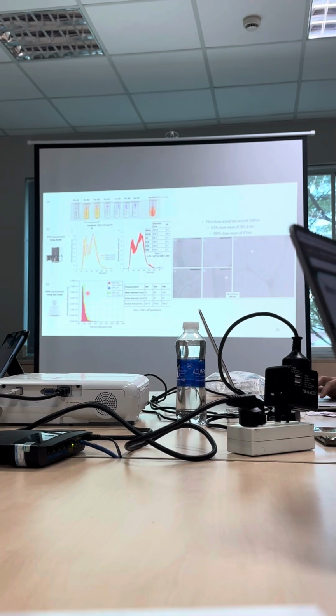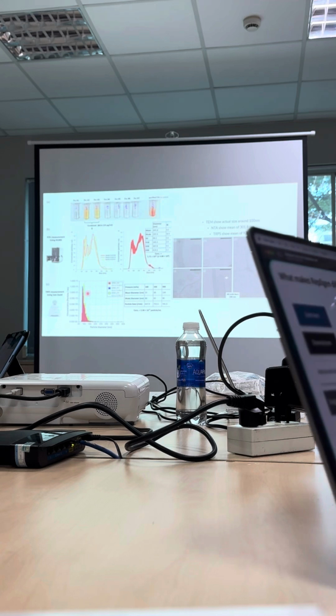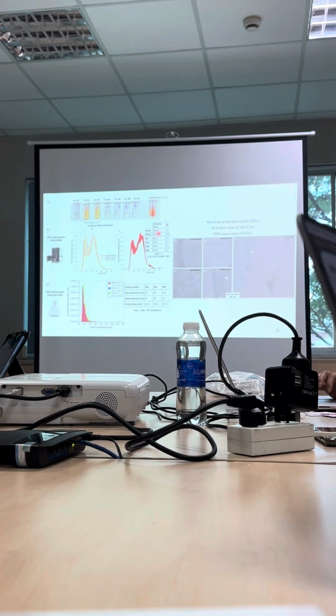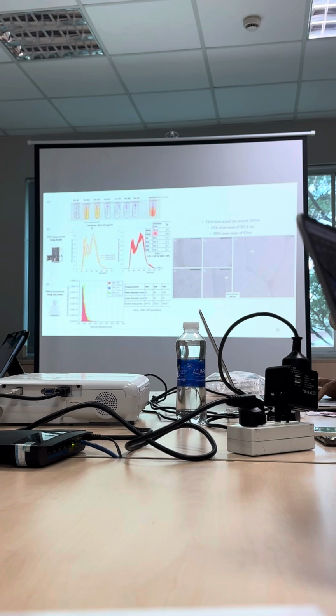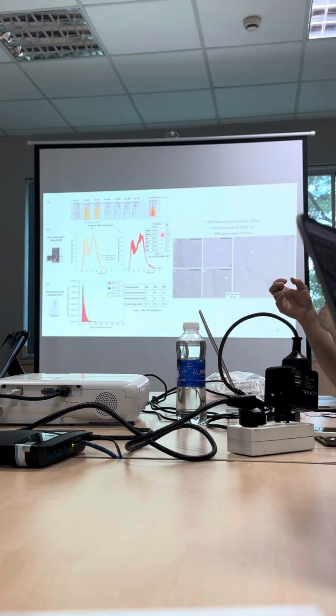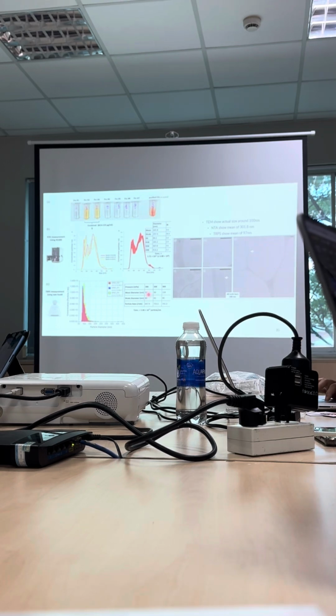And in the paper, the author followed the TRPS data, size and concentrations, for all the following experiments. Because if you imagine, in industrial manufacture, the last step is usually sterilized filtration. If you are this size, you cannot do sterile filtration because the 0.22 membrane will definitely be blocked. But by our data, the actual sample size is less than 100 nanometer. Actually, you can use the 0.22 sterilization filter to filter your samples.